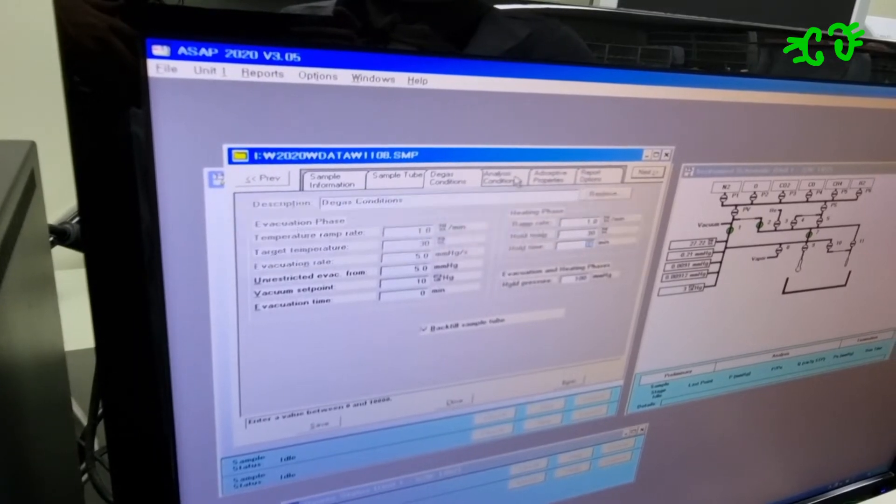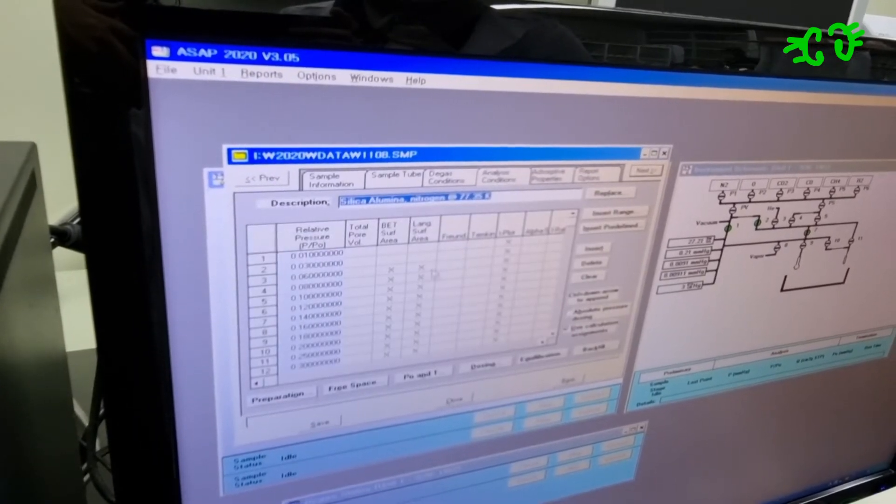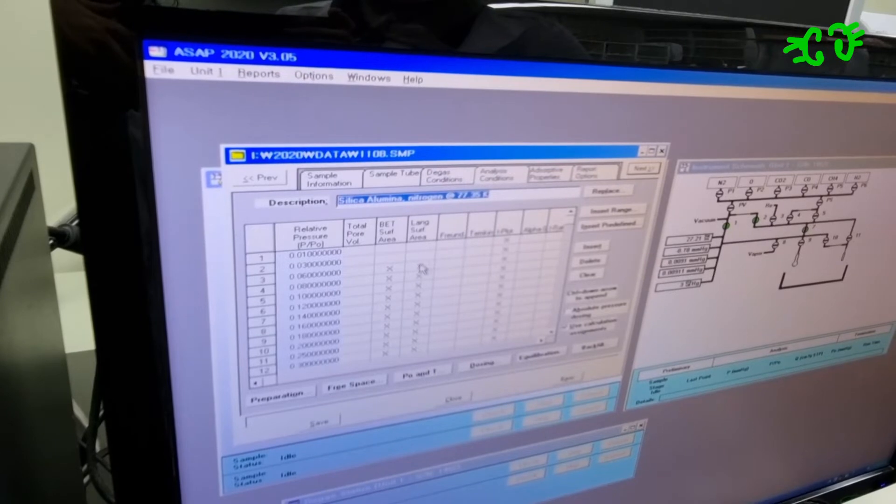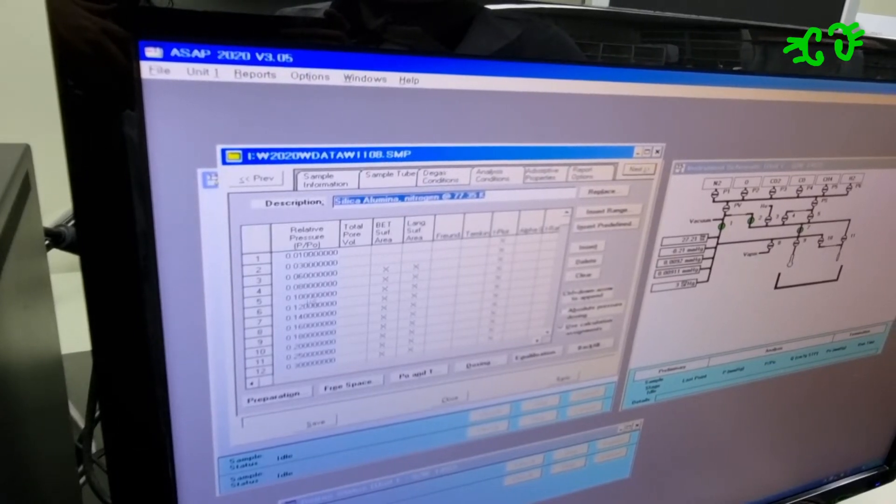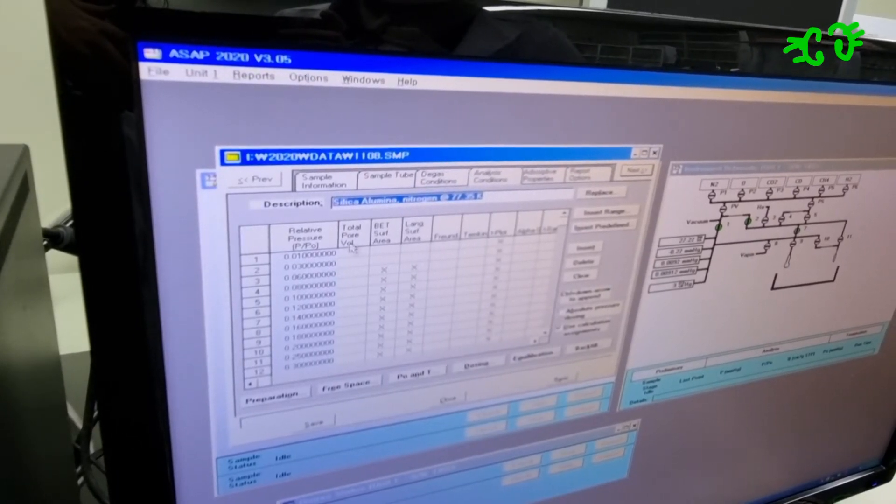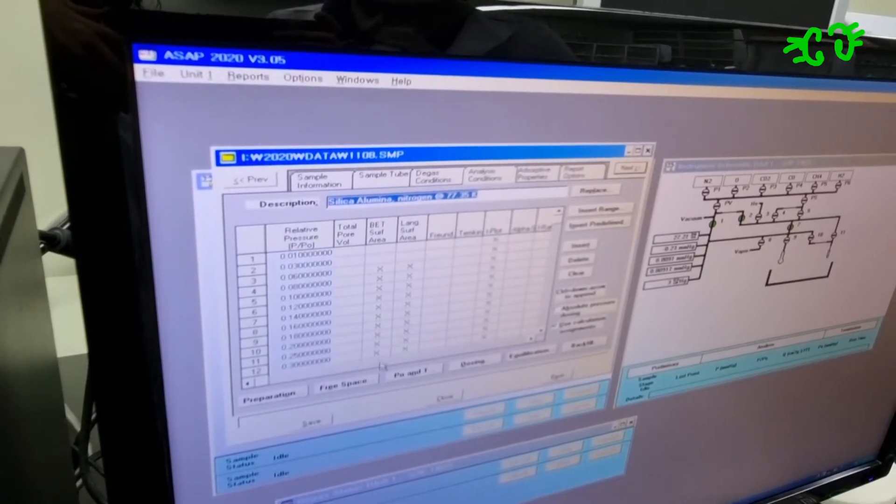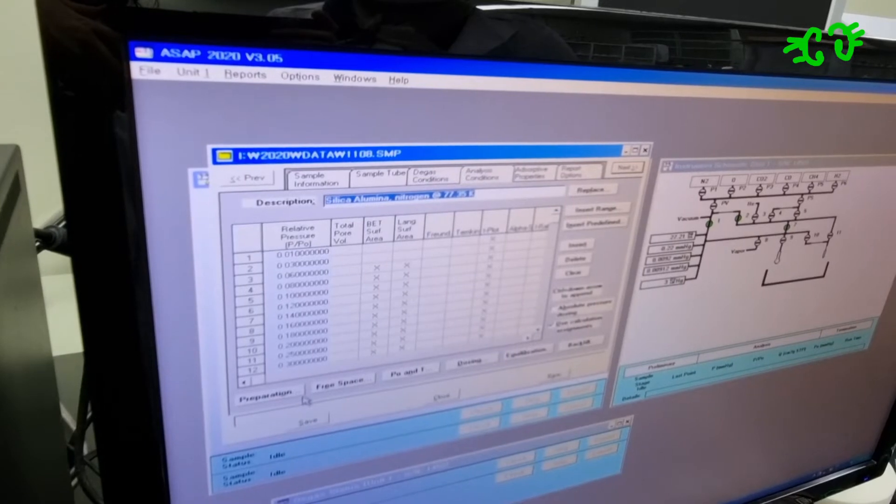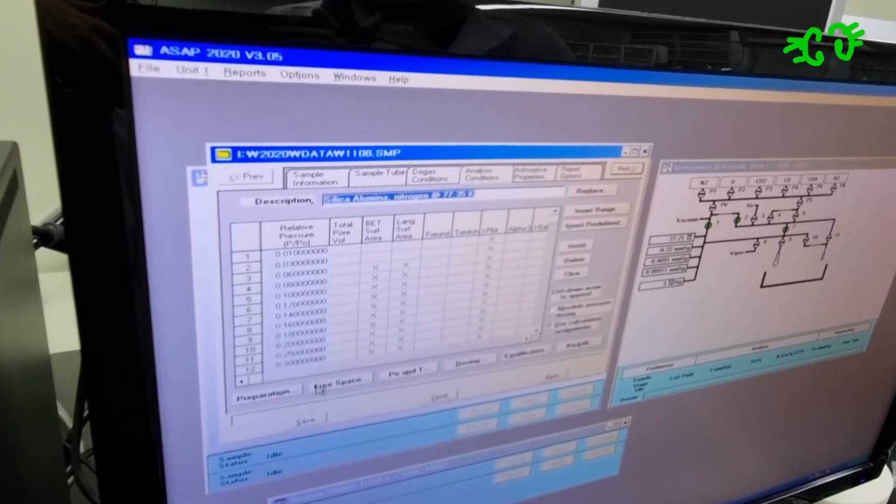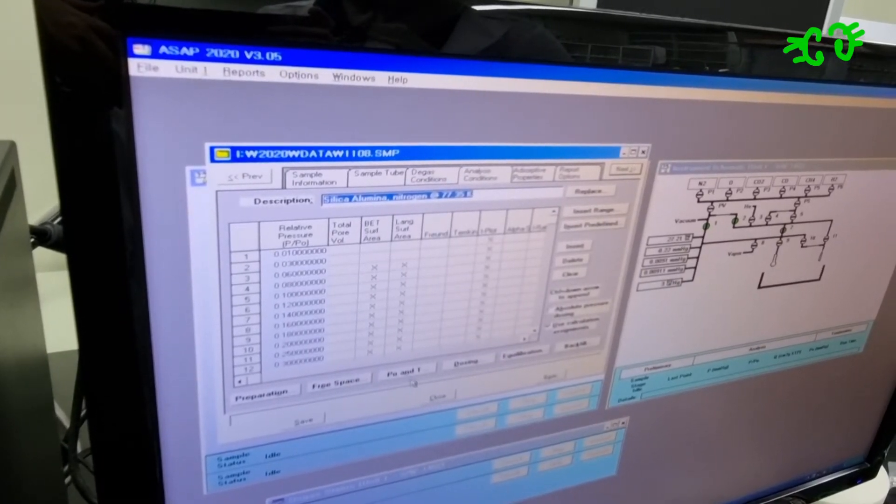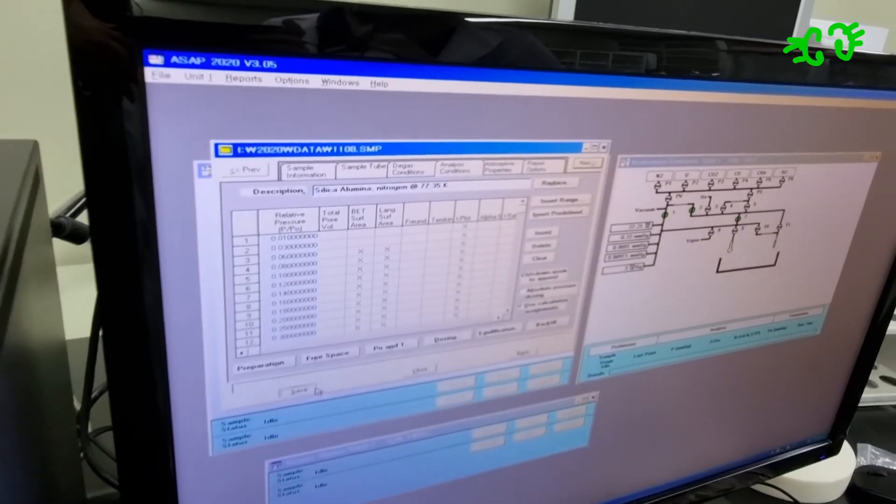Also, for analysis conditions, you can put what you want to analyze and change the pressure you want to see. Here, a lot of things you can change. Usually you can use reference, right? Yes. So you can save it.